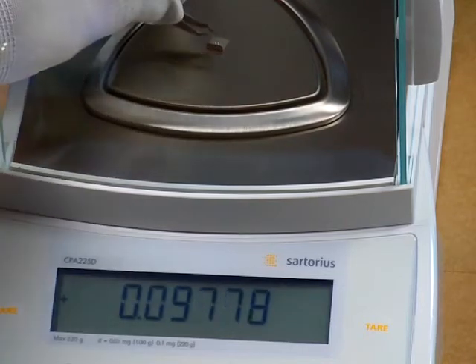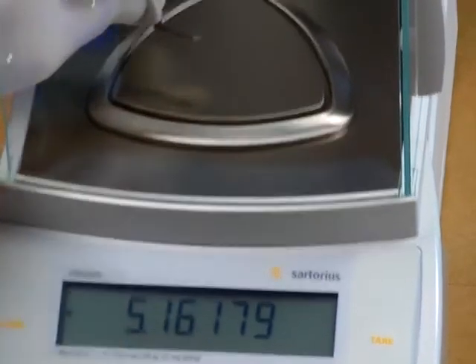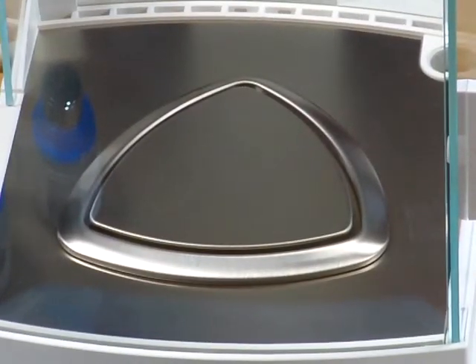Another feature of the Sartorius is the triangular weigh pan. This triangular weigh pan gives you more weighing area. It's a unique feature that Sartorius offers over competitor brands — most brands out there have a round weigh pan.